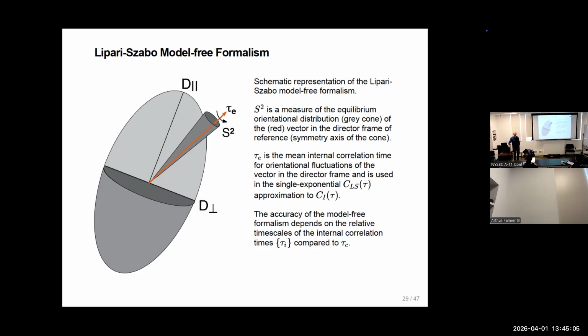You might like to know more information. You might like to know, does this look like a diffusive process or a hopping process? But the NMR experiment in solution is not going to be so good about that. And maybe either has or will show you different simulations for hops and solid state NMR. And there you have more discrimination between mechanism, and in solution NMR, amplitude and time scale.